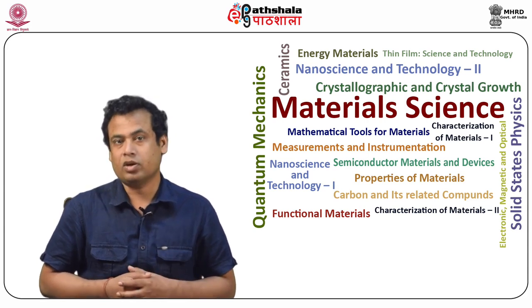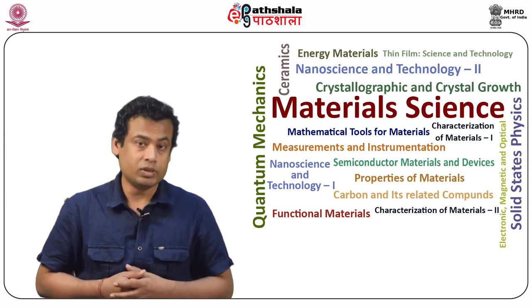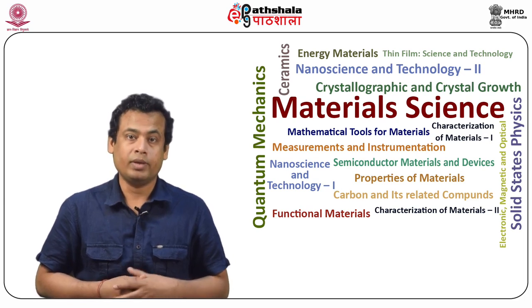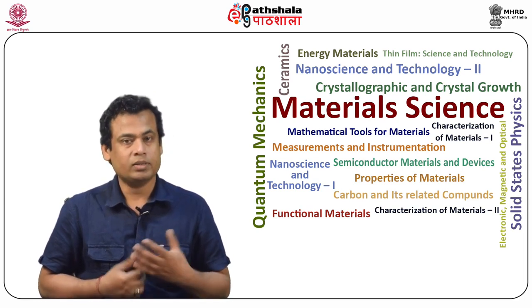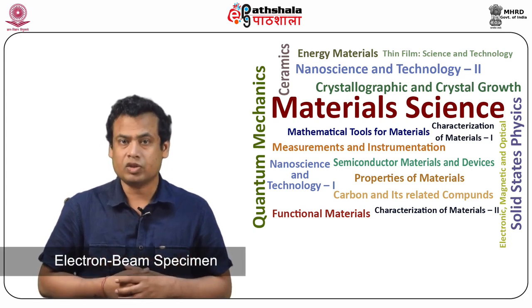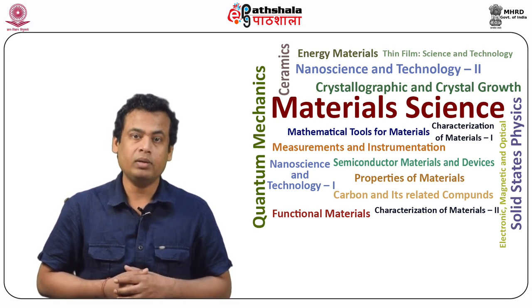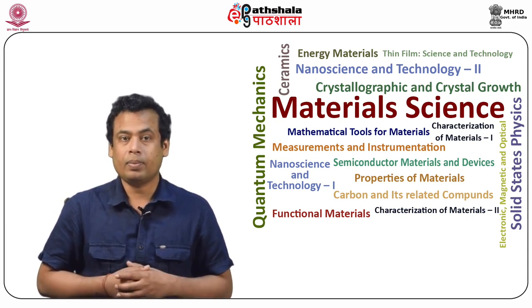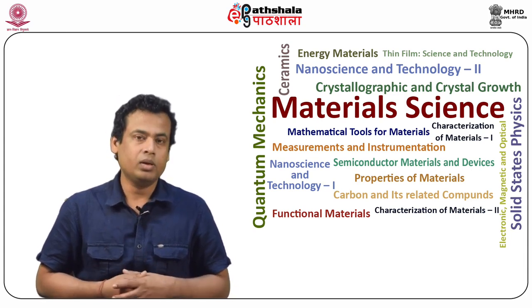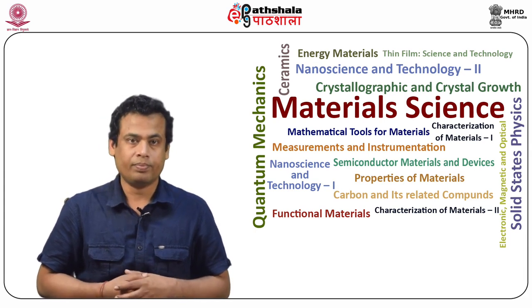The primary electron, after hitting an electron or a nucleus of the specimen, continues on a new trajectory known as scattering. The electron beam specimen interaction imparts various forms of energy phenomena which can provide interesting information about the specimen, including topography and composition and many more.